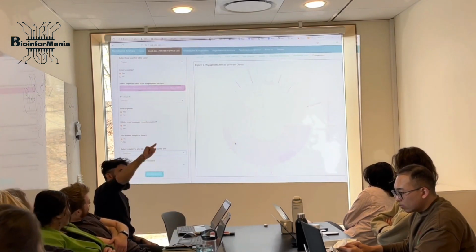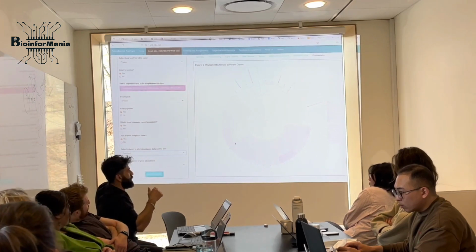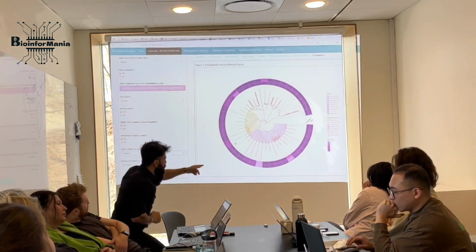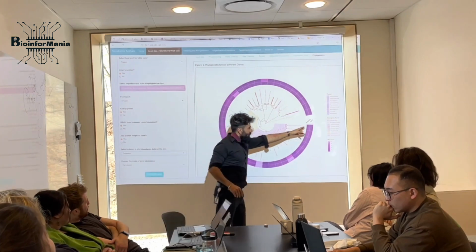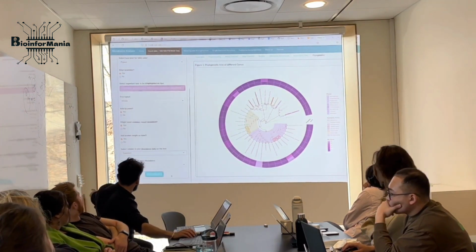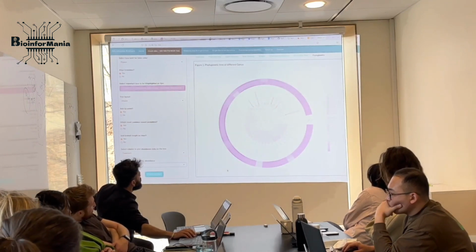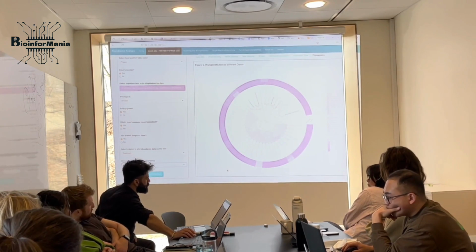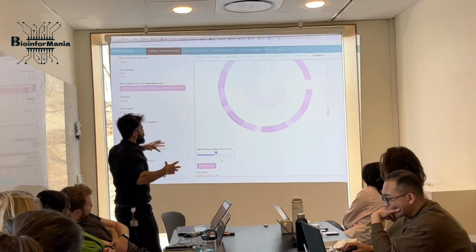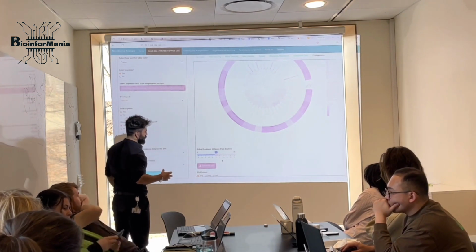You can also bring into account the abundance information depending on your treatment, for example, in this case, or week, whatever, and see how the clades are related to, for example, this naive or protozoa in this case. This one is a raw count. No, it's a relative abundance. You can also transform it into log abundance or absolute abundance. You see things are getting a little better resolution. You can also increase this circle around the heat map around your tree, right? Just heat map distance.